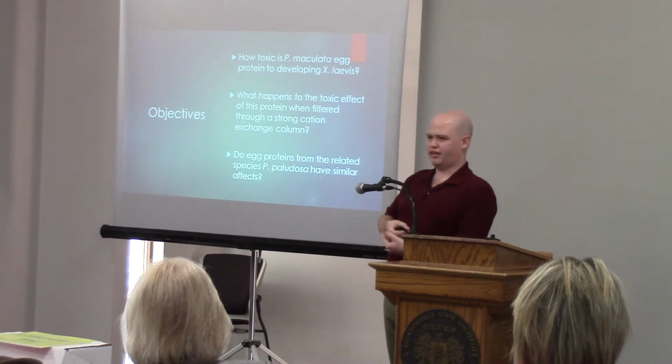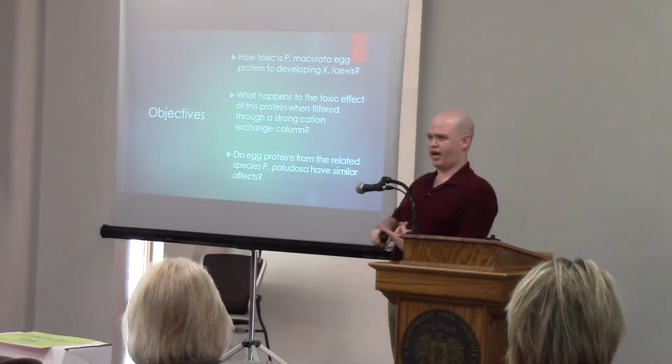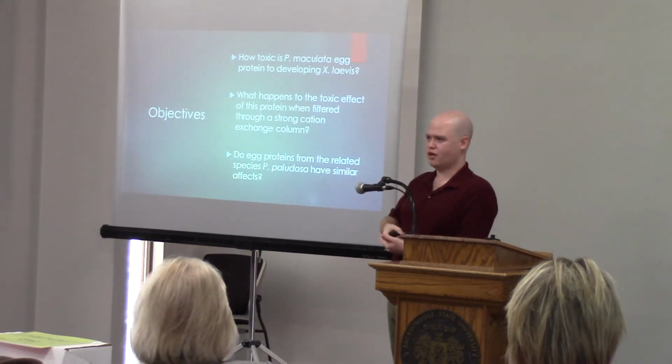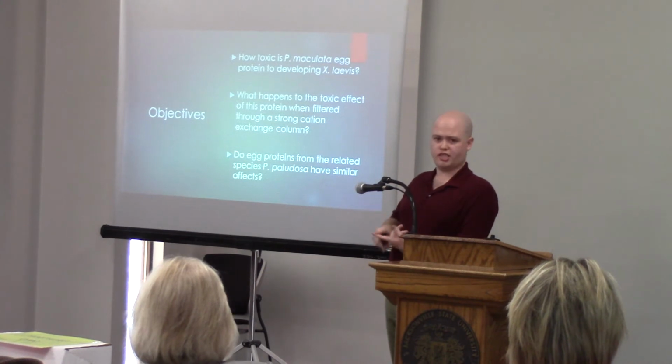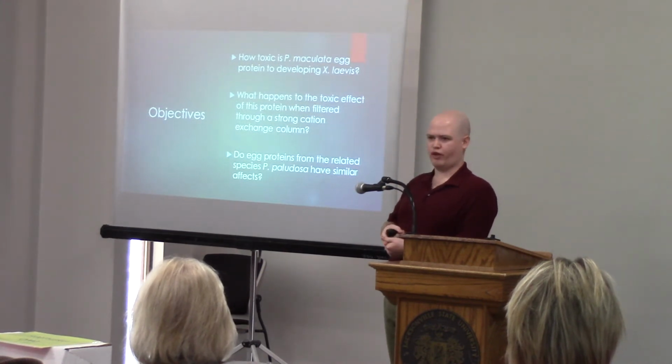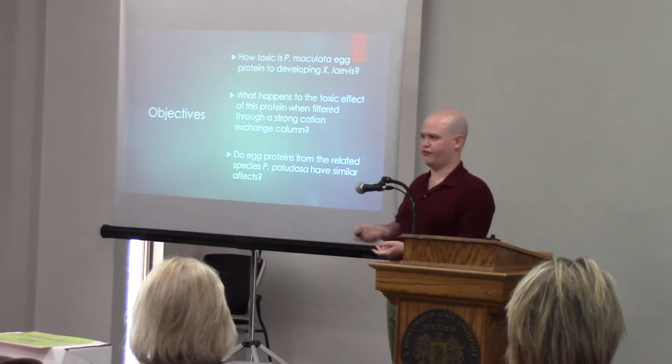So our objectives in these experiments were to see if and how toxic giant apple snail egg proteins were to Xenopus laevis. We wanted to see if we could alter the toxic effect by filtering this protein. And we wanted to see if we found similar effects from proteins in the Florida apple snail eggs.